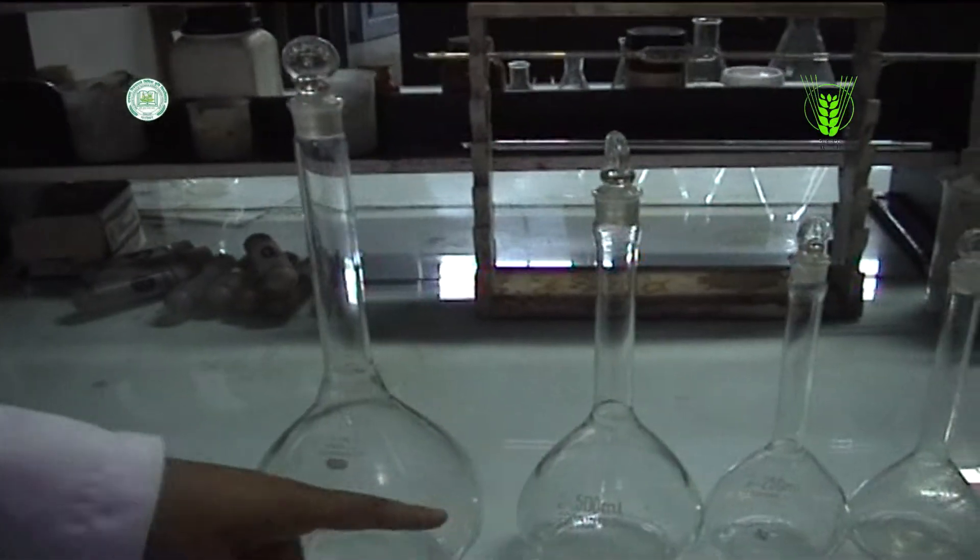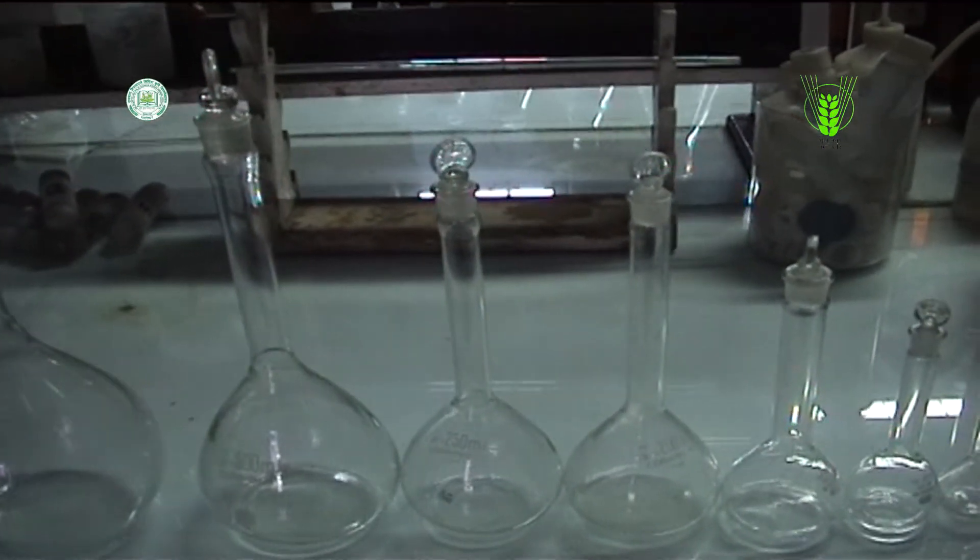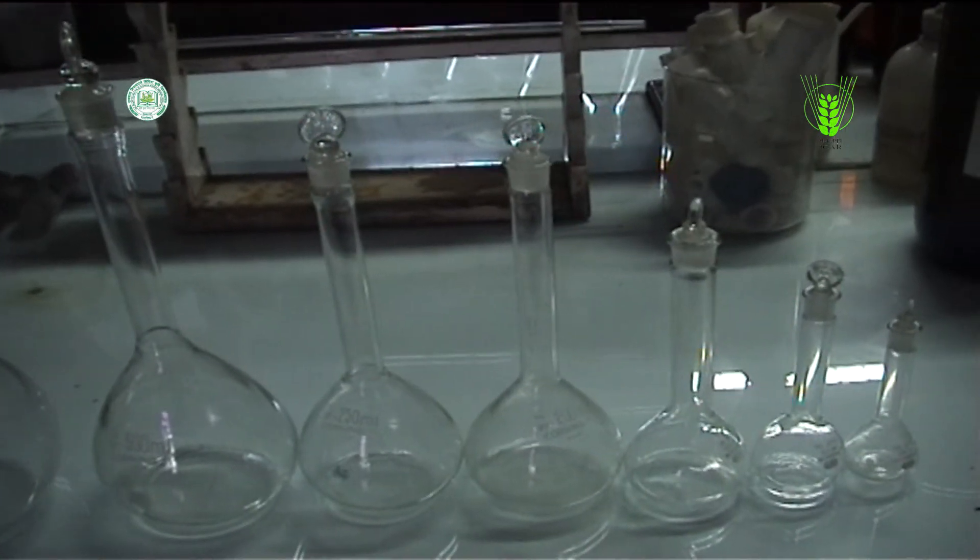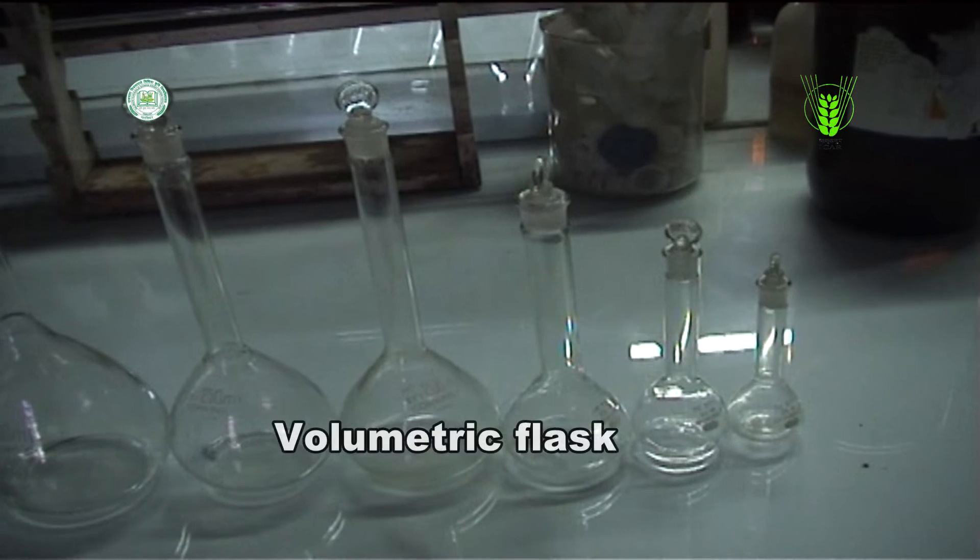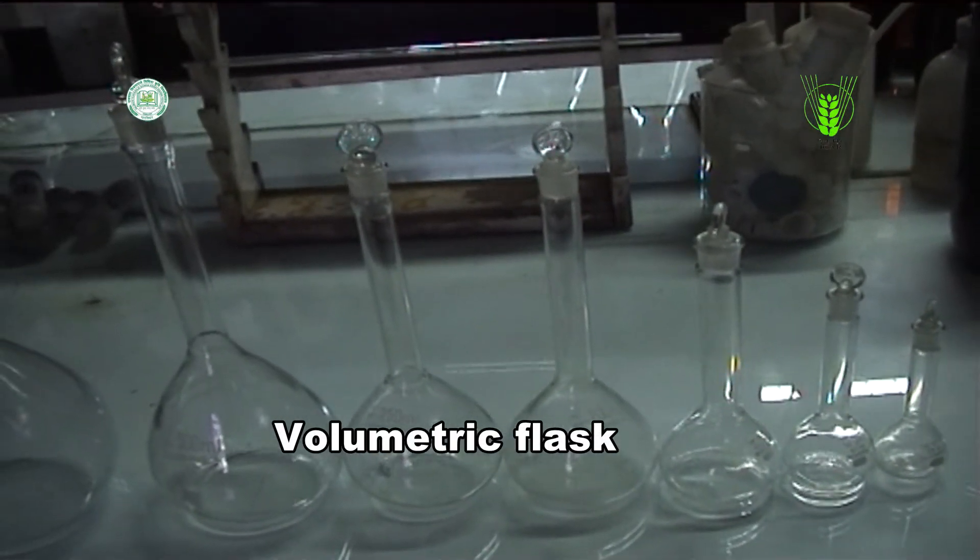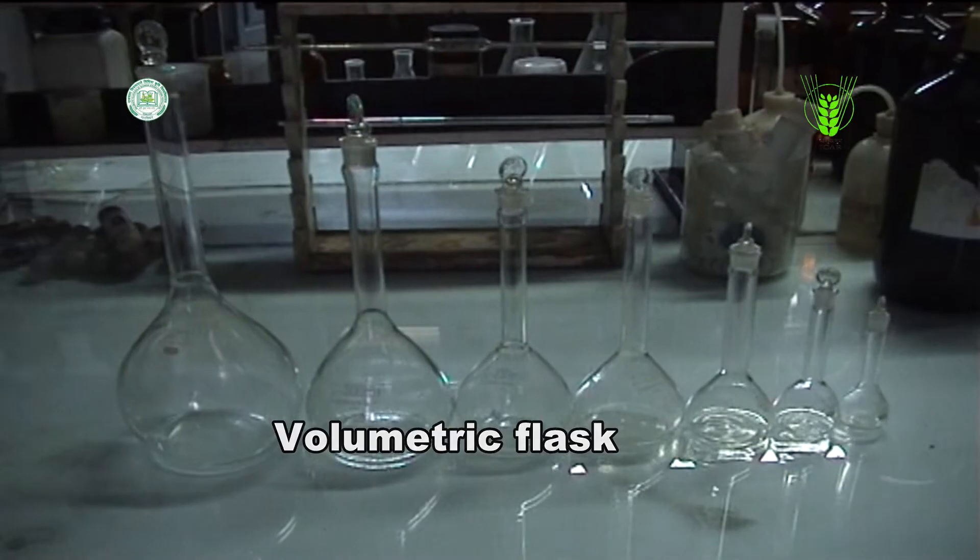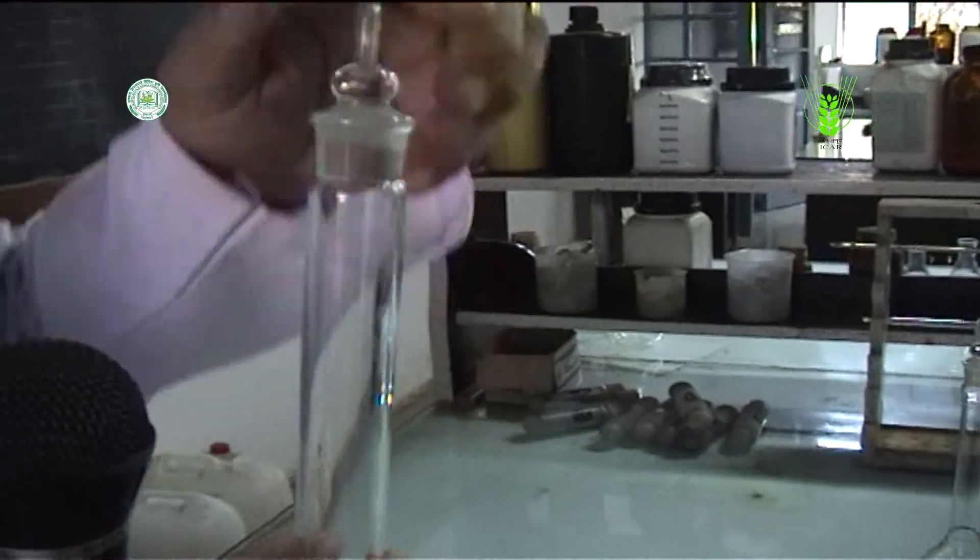Now, let us have an introduction to some commonly used glassware in the laboratory. The most common glassware is volumetric flask. These are volumetric flasks or measuring flasks or graduated flasks.